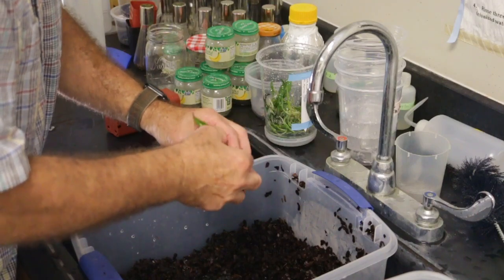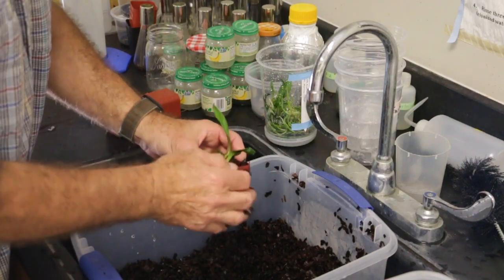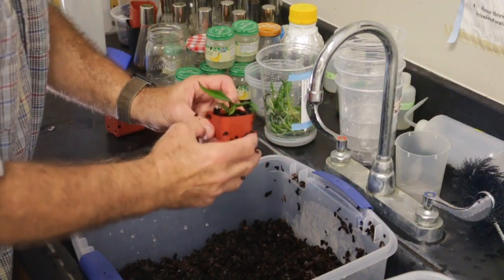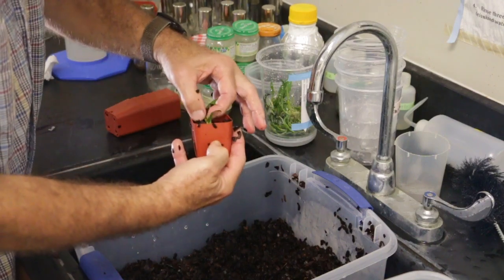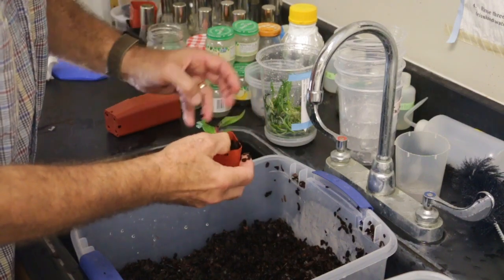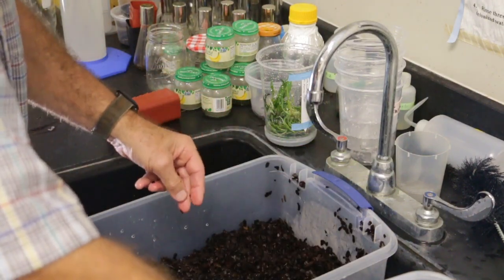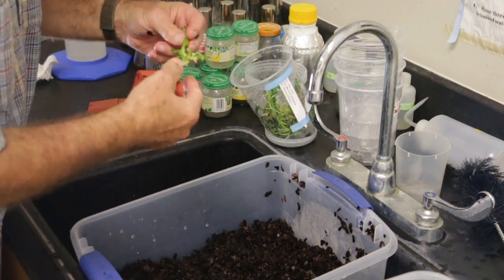Again, I hold this in the middle, and I add the orchiata bark, and I go up and down. Again, the main thing is to get this plant positioned at just the right level so that you can see the roots when they grow out of the base of the pseudobulb. So I'm going to do just a couple more, I think, and then we'll move on.